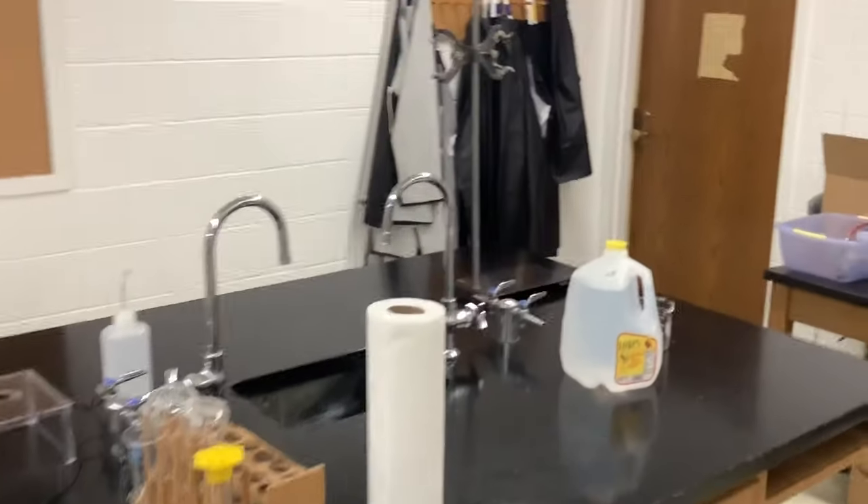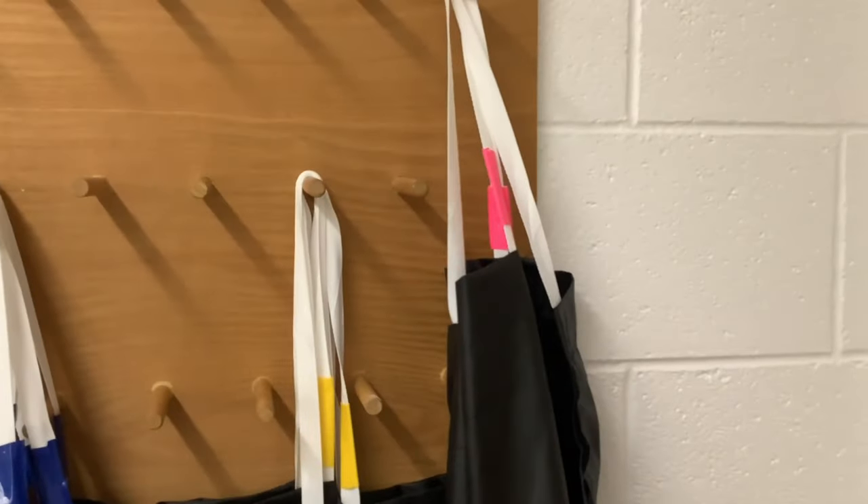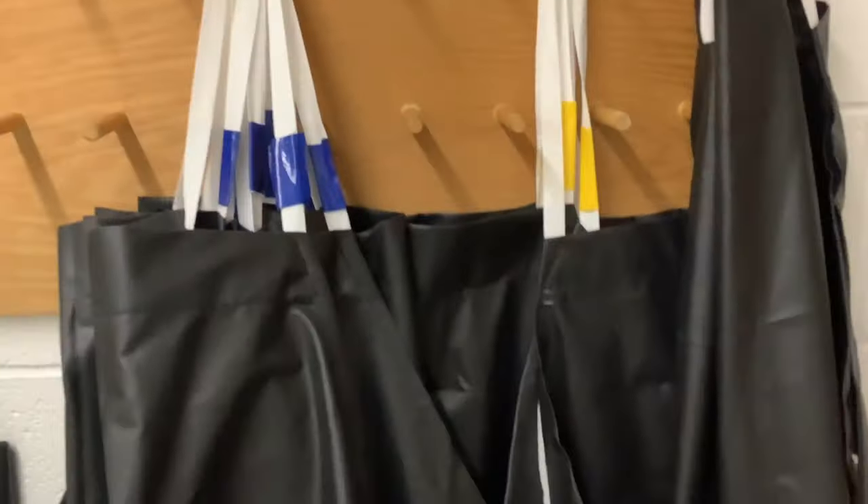Also, in addition to the carabiner clips, you can see how we color coded these for the small — the hobbit size — and then regular person size medium, and then large Sasquatch size.